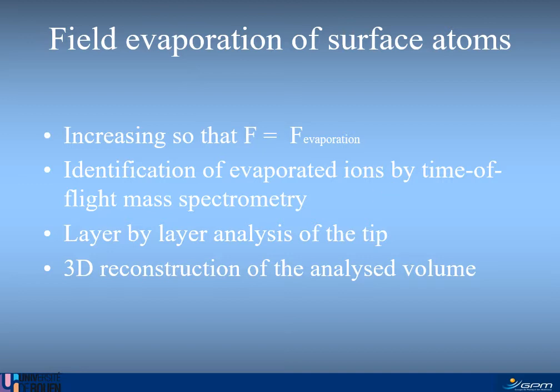And so we are able to identify atoms that are observed by field microscopy simply by time-of-flight mass spectrometry. This is the principle of the one-dimensional atom probe.